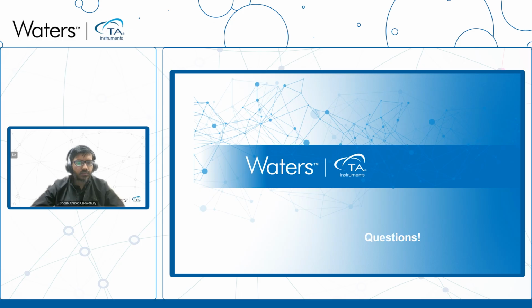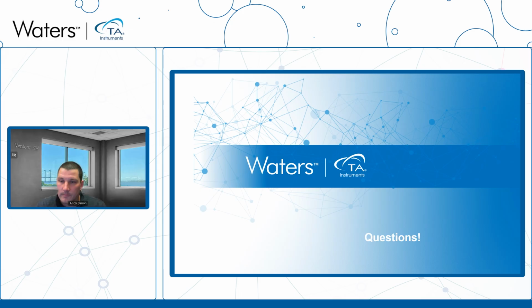The second question, and Shoaib, this one's for you. On slide 27, the question is about the most important glass transition definition for the HIPS material. That with the peak temperature of tan delta would be considered a material glass transition, but that's not exactly what was said. So Shoaib, can you address that?